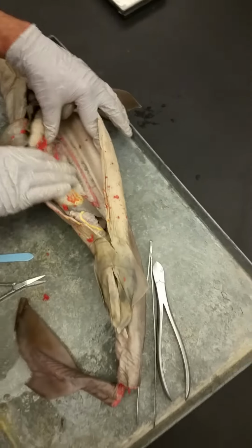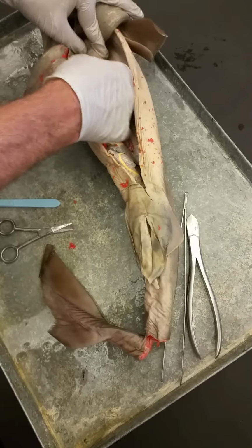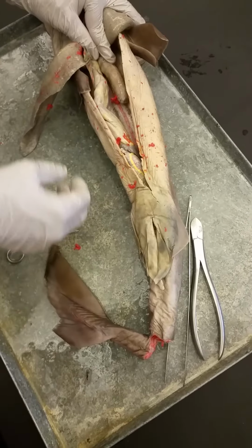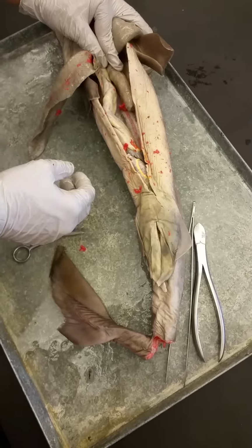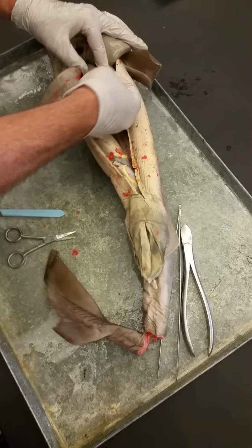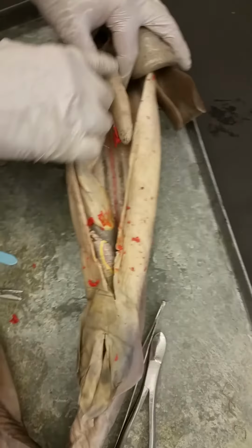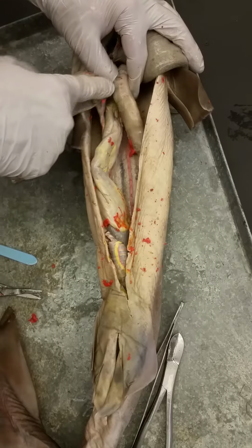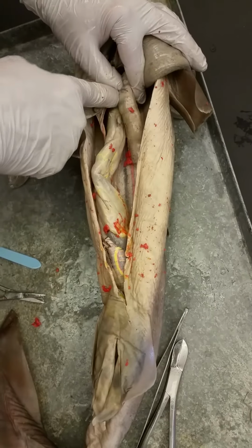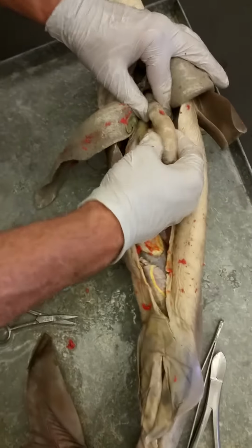Just as an analogy, that's the kidney around there, the pink part. And this was what gender? Male, so we expect to see what type of gonad? Testes. So here's the testes. Testes are up here, which would then be connected to the seminiferous tubules, which would then go back to the cloaca as well.